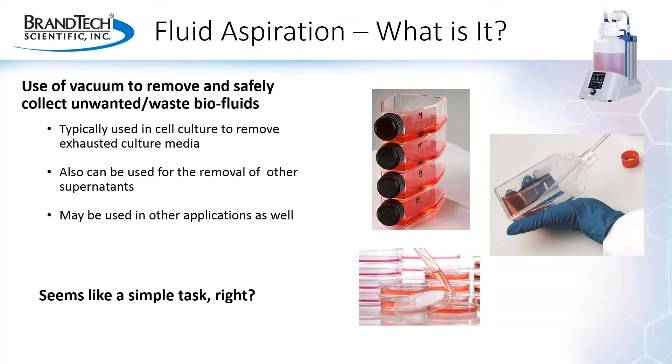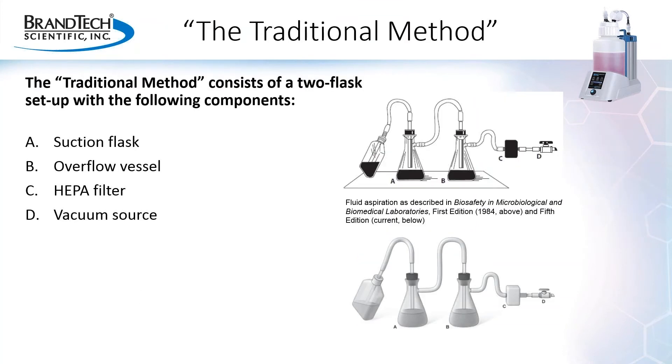This seems like a really simple task, right? So what is required to perform fluid aspiration in the lab? The traditional method, as first described in biosafety and microbiological and biomedical laboratories back in 1984, is what is commonly referred to as the two-flask setup, and is considered the standard for fluid aspiration in the lab. This setup consists of four basic components: one, a suction flask, labeled A; two, an overflow flask, labeled B; three, a HEPA filter, labeled C; and four, a vacuum source, labeled D.